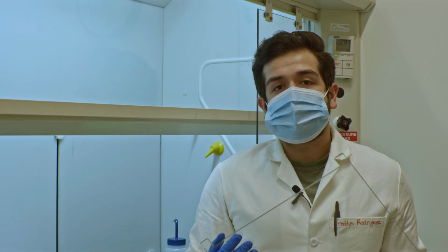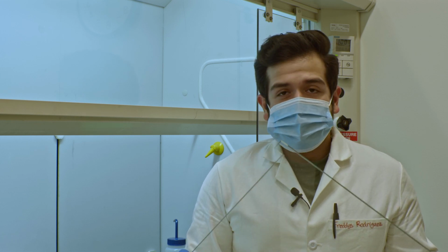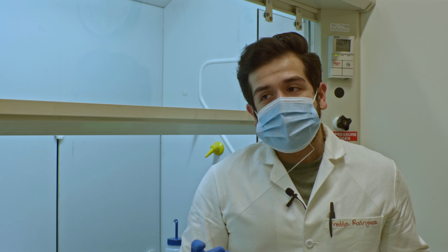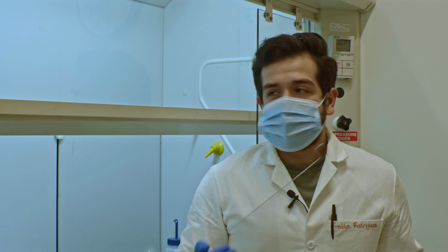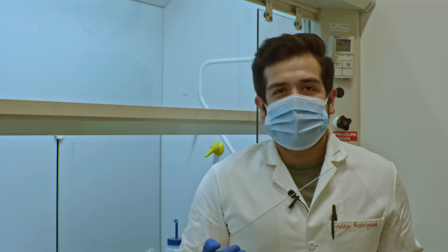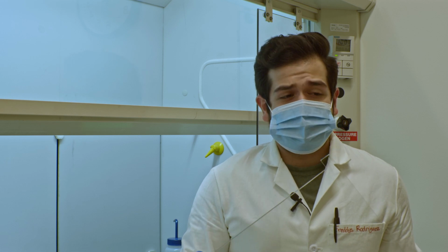One of the next things you have to do for this assay is of course set up your gel. These gels, as you can see from this glass, are quite long, and that means they're quite thin. So they are very fragile, and they also take quite a while. You should do this step as early as you can in the day whenever you're setting up this assay. Sometimes you'll have the best of luck and your gel will come out cleanly and look great the first time attempting to set it. However, sometimes you may have a bad day and you might have to try 3 or 4 times until the gel looks nice and sets.